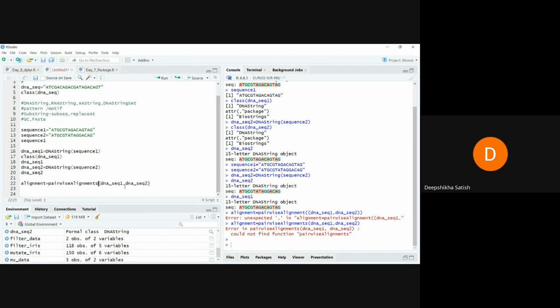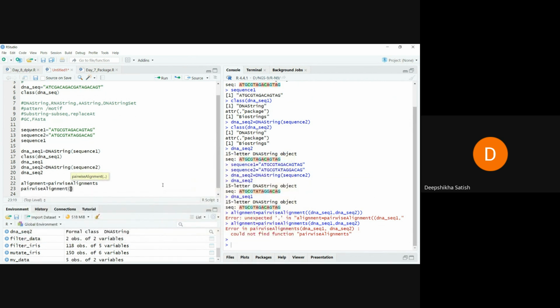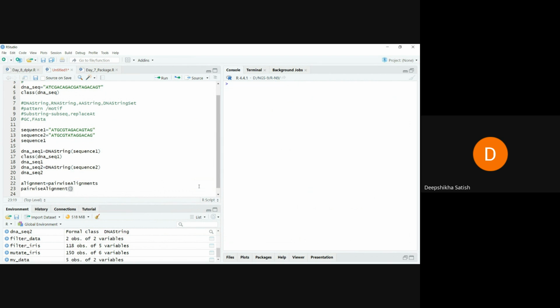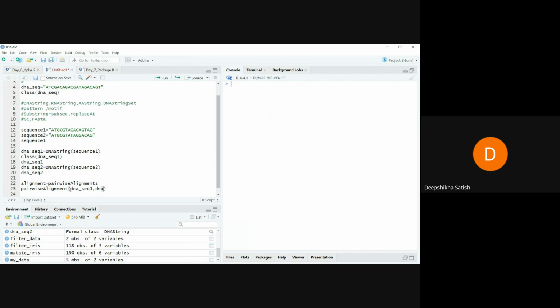Let me check. Okay, let me execute first. You can try this. Done. Got the result?